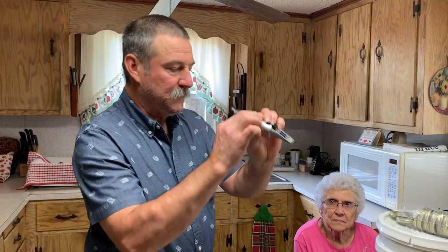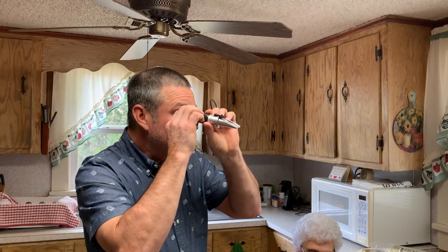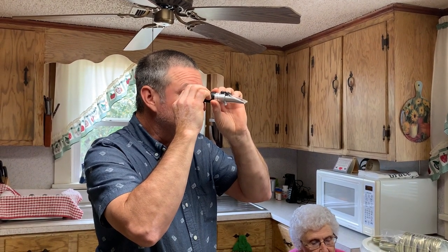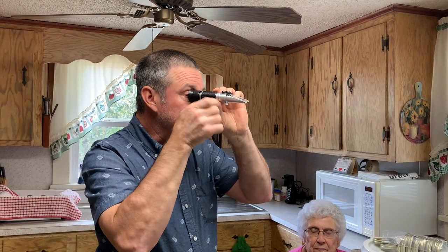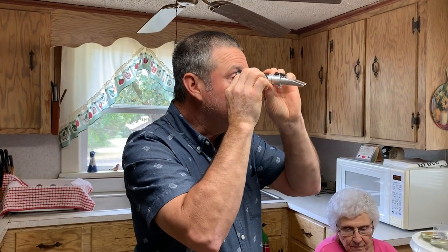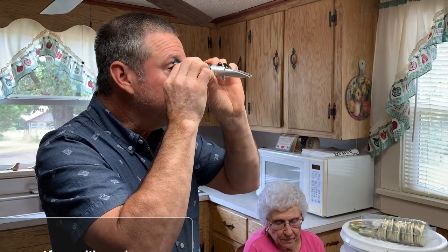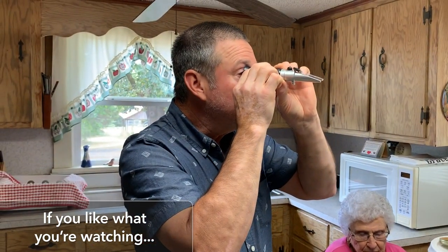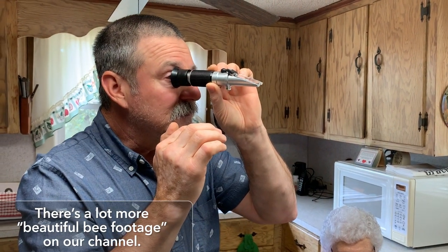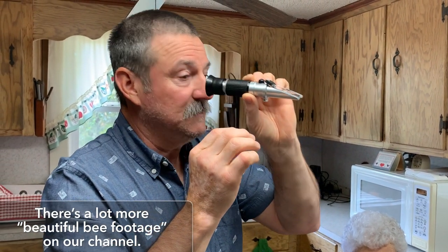So when I look into the refractometer, I have a Brix reading, which is our substance. We have a water percentage, which is what we're after. So this honey, between a defined blue line and a white line, is 18% moisture content.